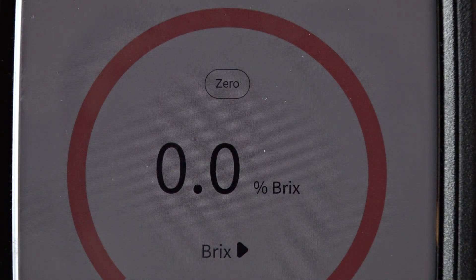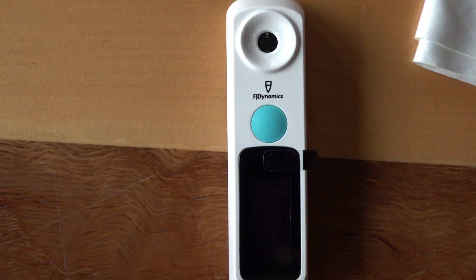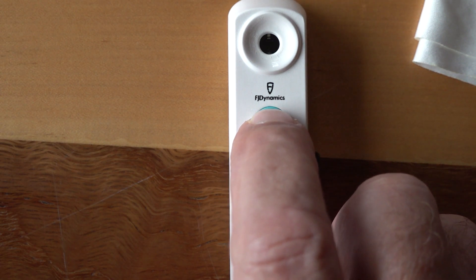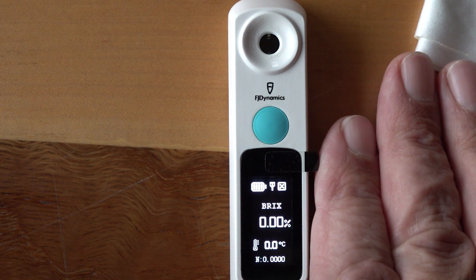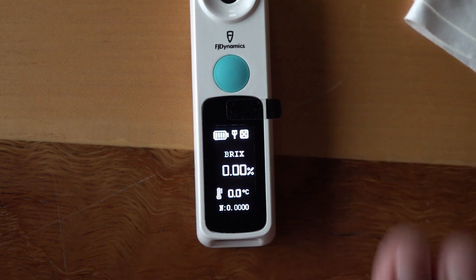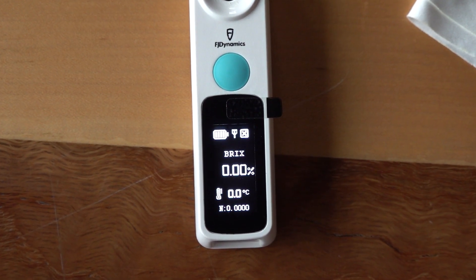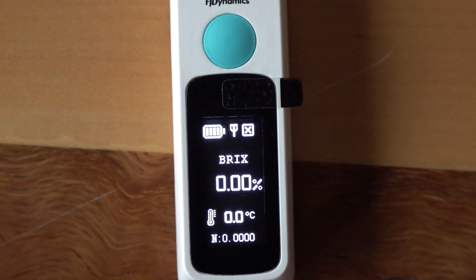Here we go — Die Fluid. It has the same logo that's on the packaging, which is a good sign. Turn on the device because I want to cover how to pair it with your phone, because without your phone you're not going to read water percentages. All this thing does on its own is read Brix, and that doesn't help me. When I'm testing honey I want to know the water percentage straight up — that's all I care about.